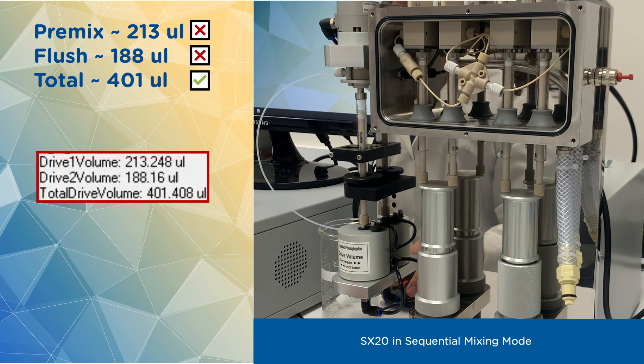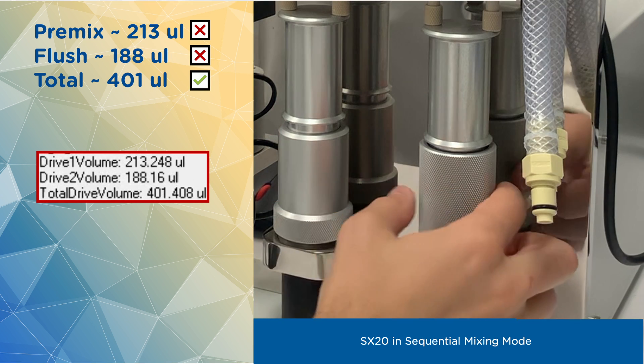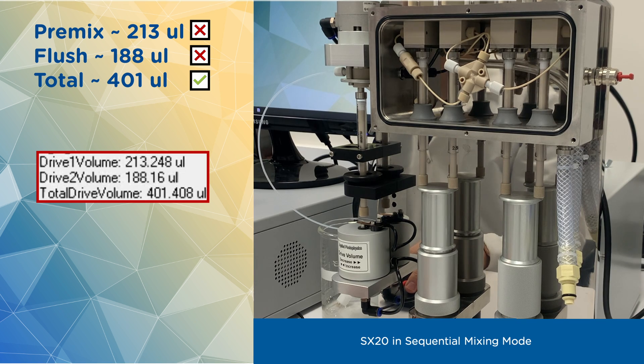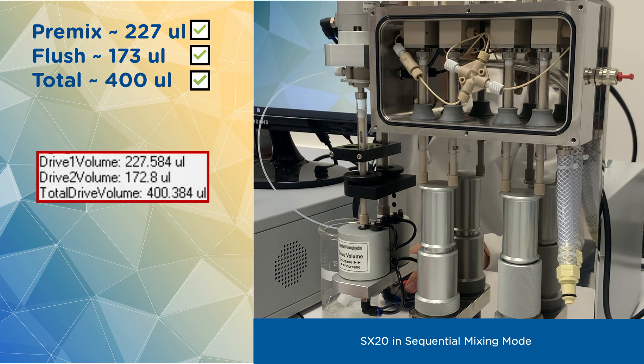After adjusting total volume, I am going to adjust drive 1 volume to bring it closer to 220. Direction of adjustment is the same. After adjusting, repeat the run and look at drive profiles. If they are correct, you can proceed with performing sequential mixing experiments.